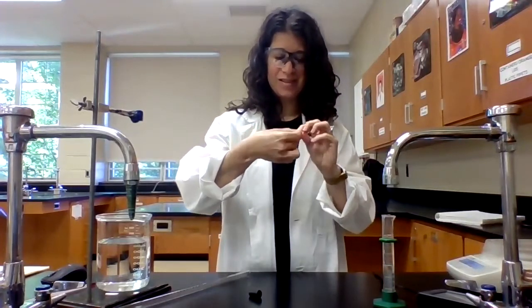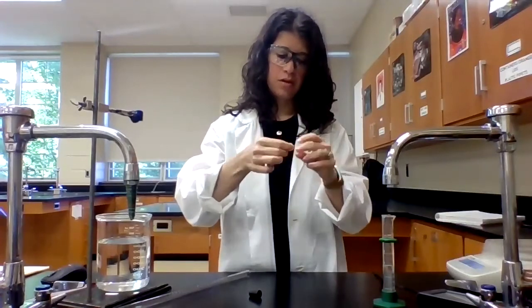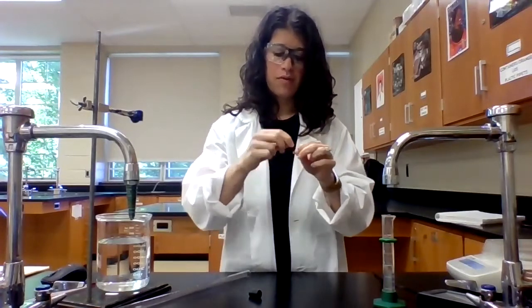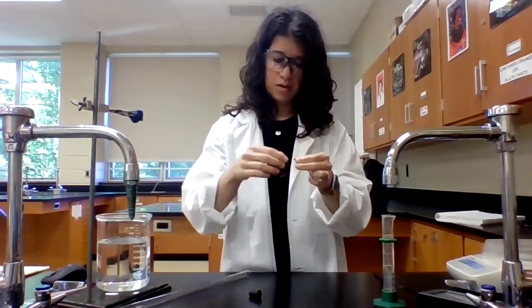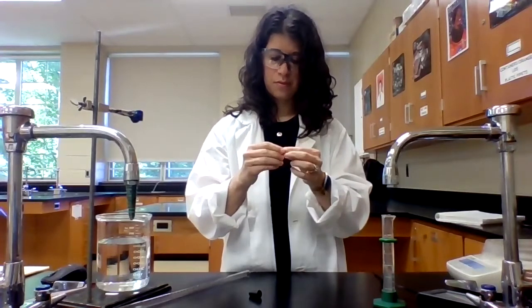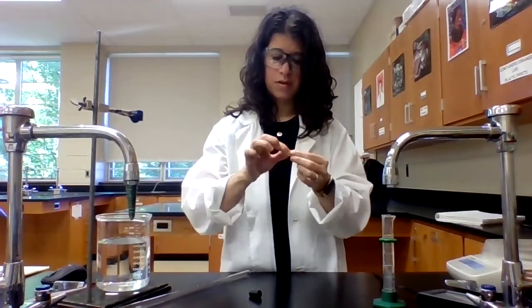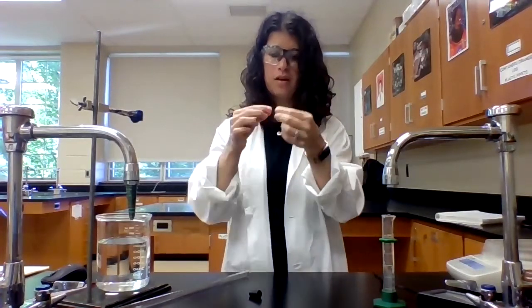I'll go around the ribbon. Again, the better that you wrap this, the better. I'm going to make a little hook at the end of my copper wire.